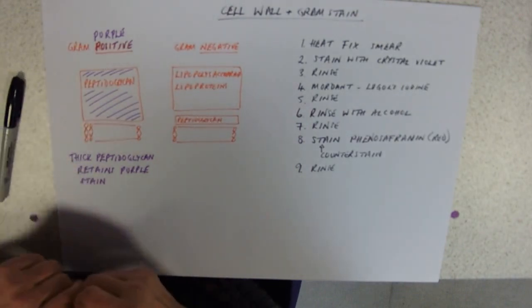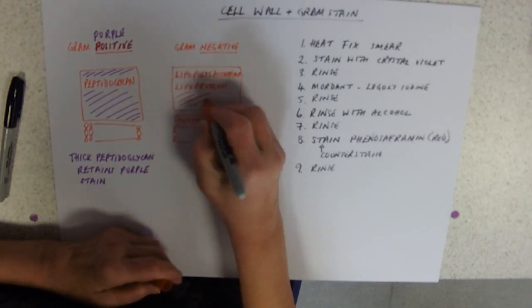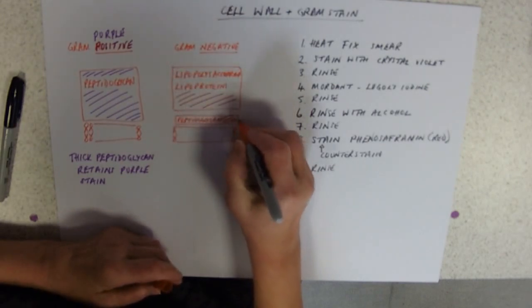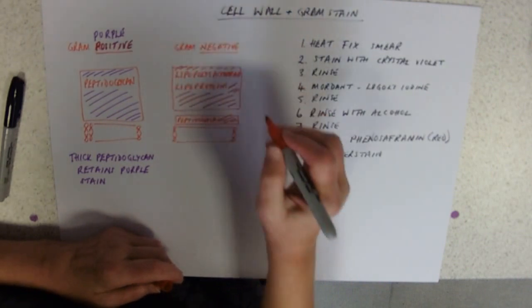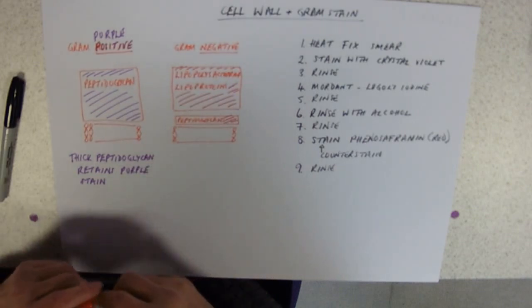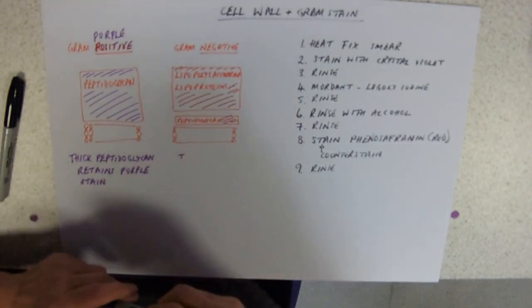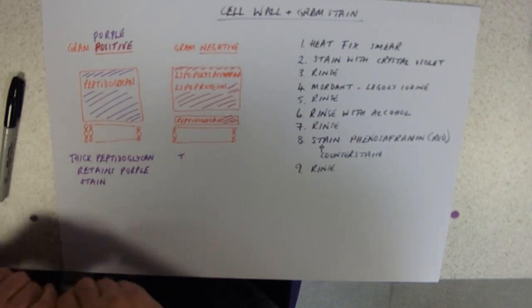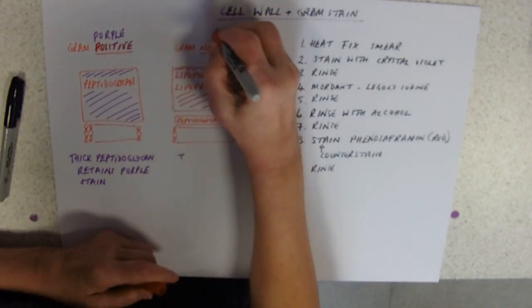And what happens with the counter stain is that those gram negative bacteria are going to retain—they're going to be counter stained red. So why are they counter stained red? These are going to be red.